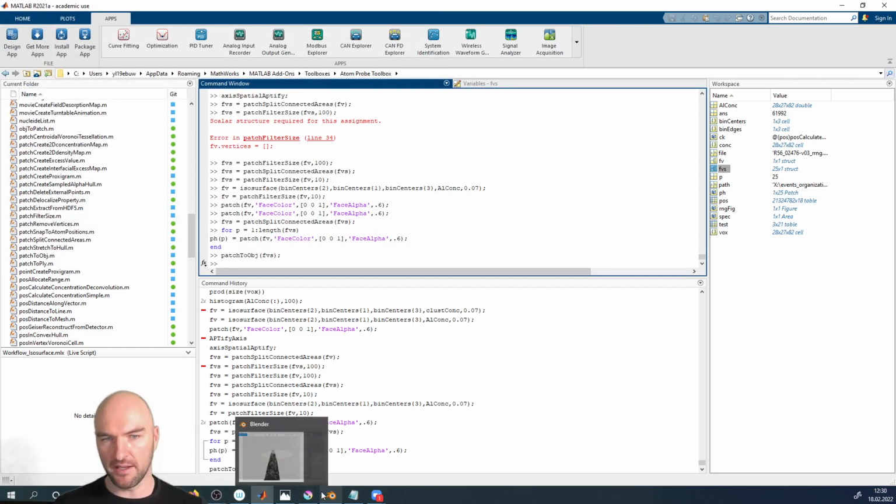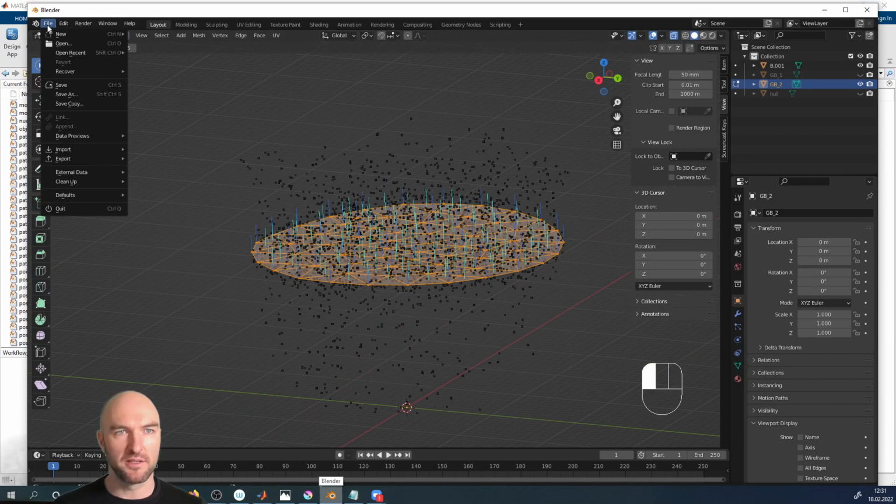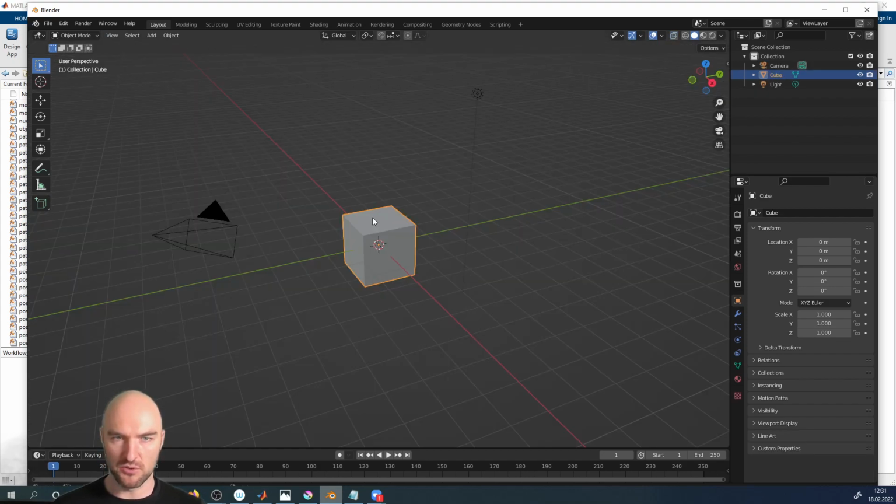And let me open Blender, and I'll just open a new Blender file. Open general, and we'll just discard that one. Usually, if you do analysis, I would save this as an analysis file, but we've saved everything externally, so I'm not going to do that right now.